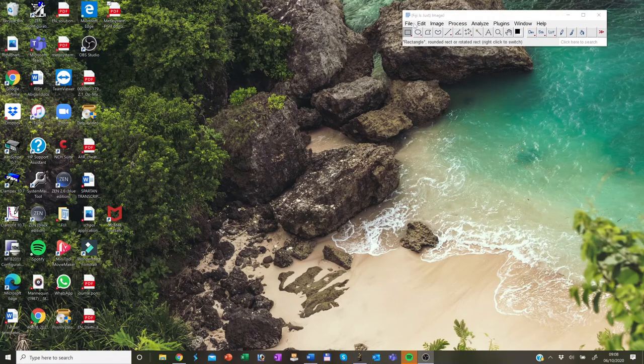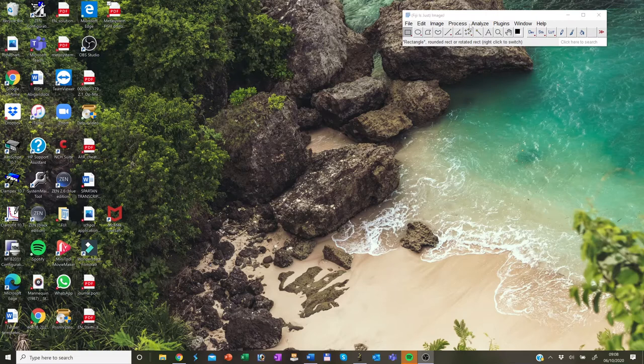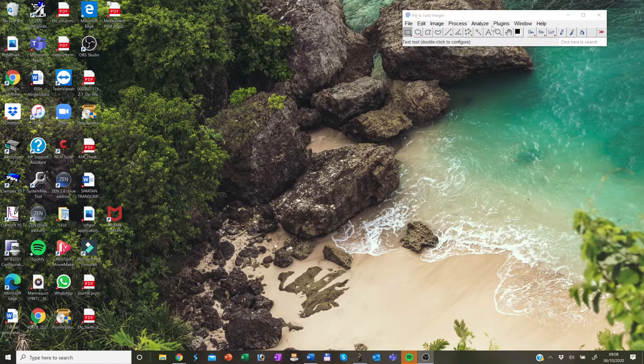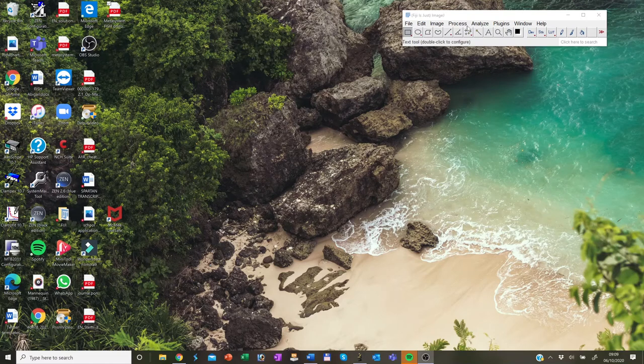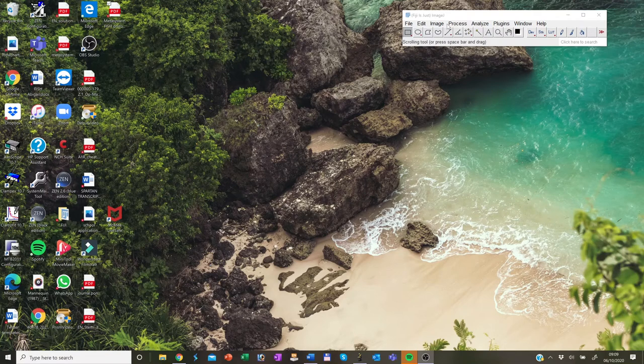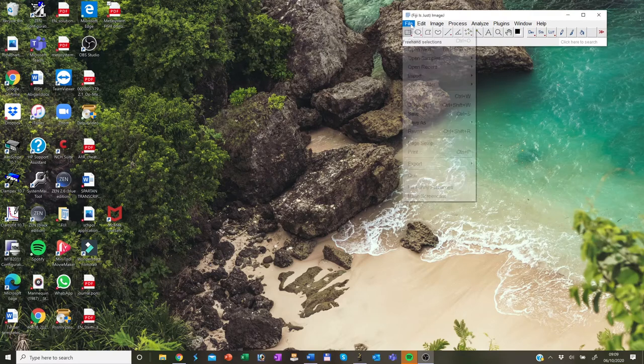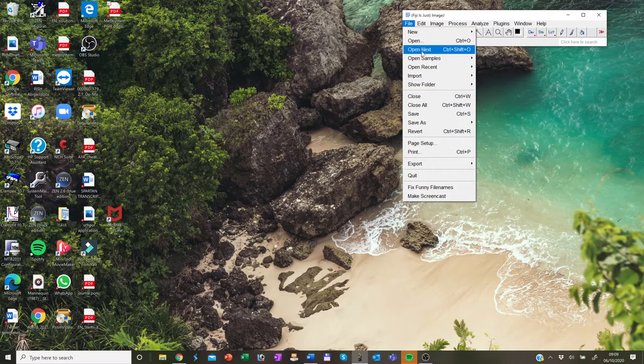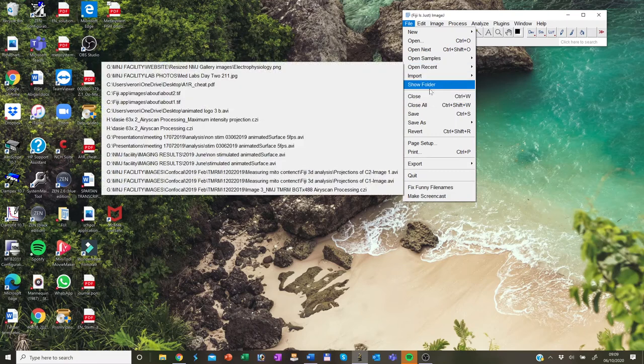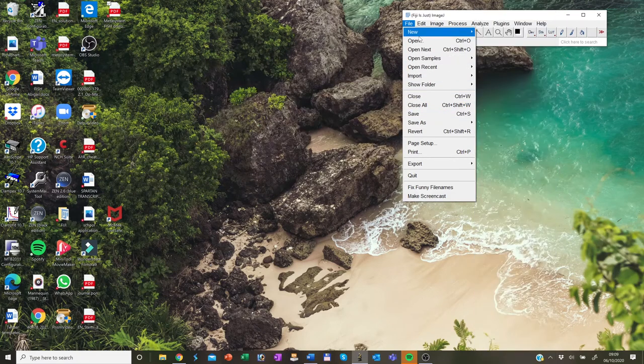Okay, so let's start with the menu bar. In the menu bar, you find most of the functionalities, such as loading the samples, saving files, processing them, and all the plugins will be installed into the menu bars. So let's just go through each of them. First is the file. This mainly covers the file input and output, how to save them, how to open them.